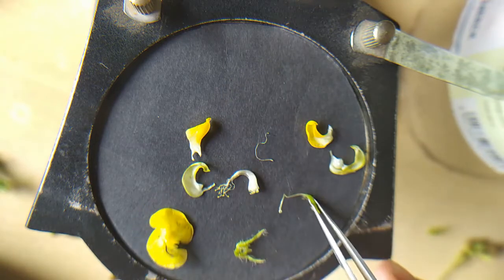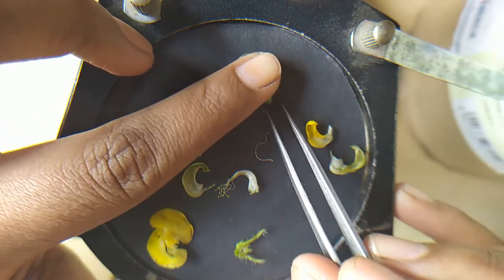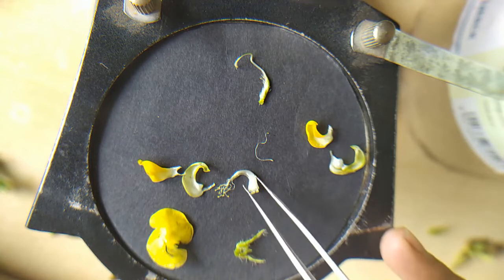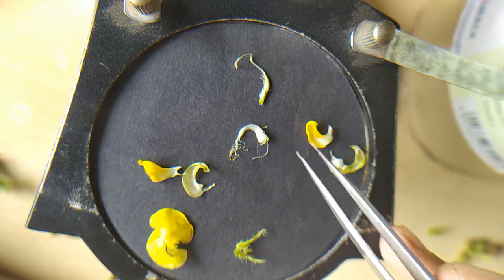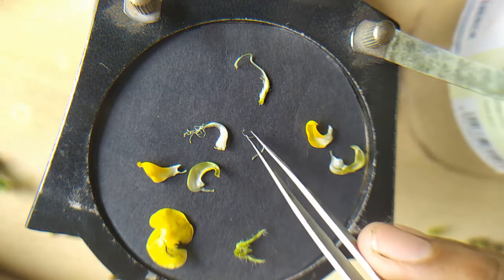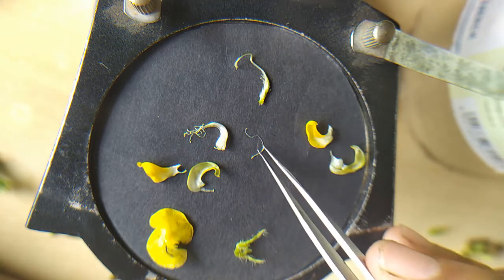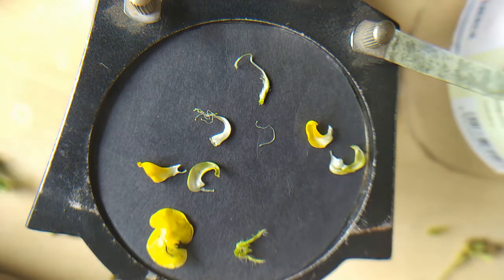Now, how to arrange this dissection? Firstly, arrange your gynoecium because it is the innermost part. This is the gynoecium of urad bean. Then the 9+1 condition of the anthers. You should keep a space between these two parts, so that the 9 and 1 can be identified in the pasted dissection. You should keep some distance between the one anther separated and the 9 anthers separated.